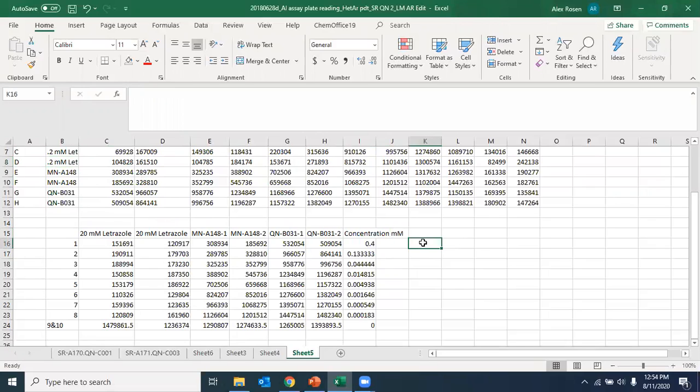So what that means is our starting concentration would be 0.004, right? Because it's 1/100th of the concentration here, so this would also be 1/100th of the concentration here, right? And then again, you would just do the same thing where you divide this by 3, and that's all you have to do to get this concentration value.